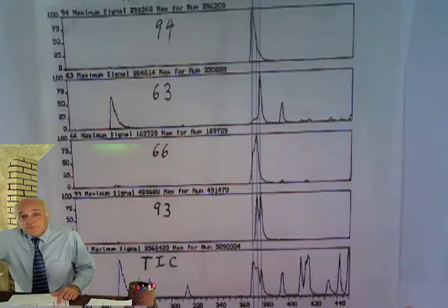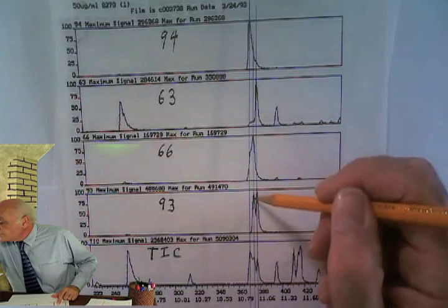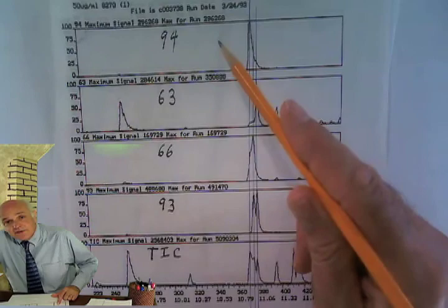Notice the 94. We have a nice big peak here for 94. Notice the 93. We got these two very distinct peaks. The 94 doesn't show up on the 93 at all, and the 93 doesn't show up on the 94 at all. The quadrupole mass spec has no problem whatever separating the 93 from the 94. It's pretty amazing.